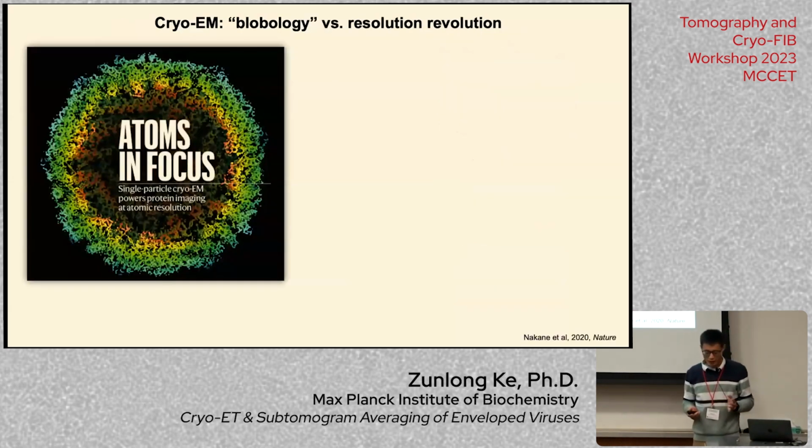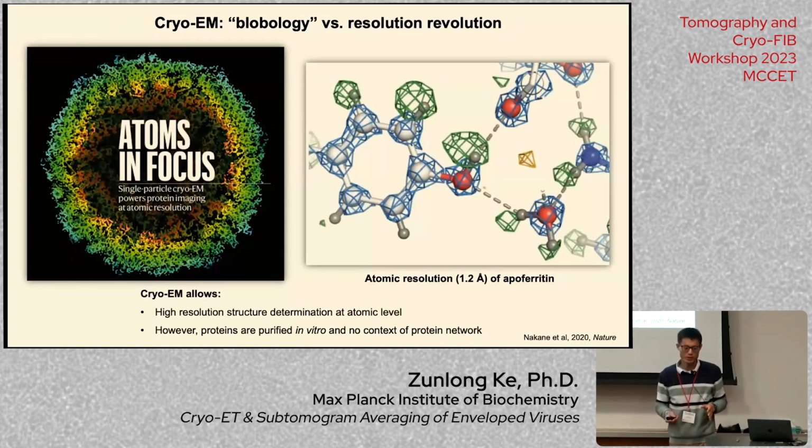So cryo-EM, that we all know, has evolved so much. This image here shows the atomic structure of apoferritin, at 1.2 angstroms. I think it is truly amazing.